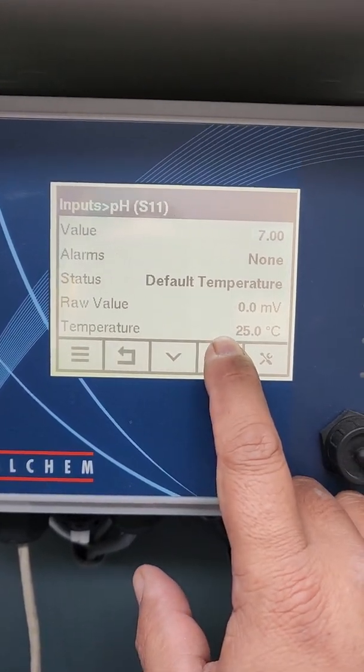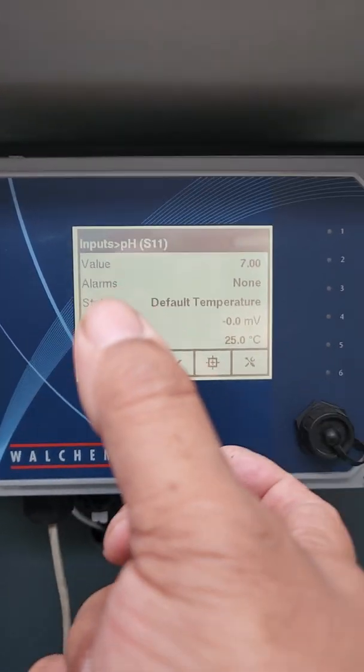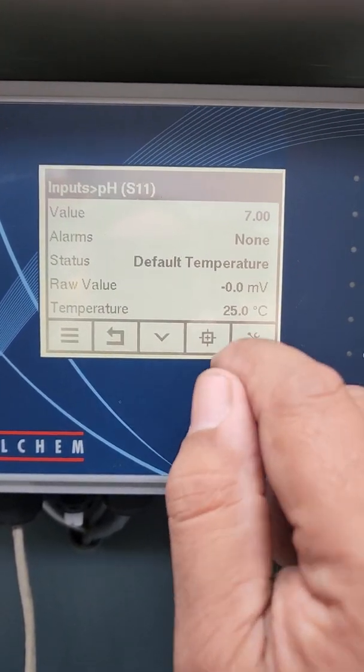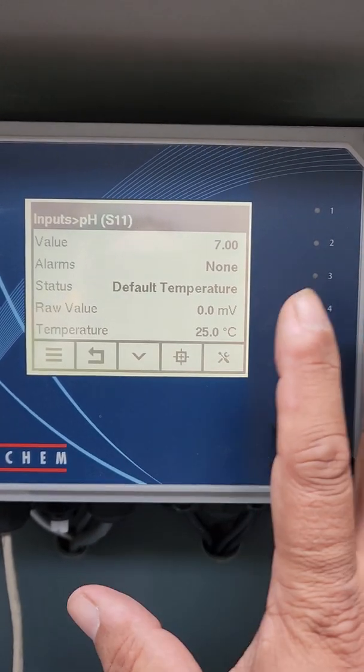So obviously that's when you hit calibrate. But to reset these numbers back from these adjustments to factory standard, you have to go into where we went to before, which is the settings, scroll down until you get to reset calibration values and go from there. Cool.